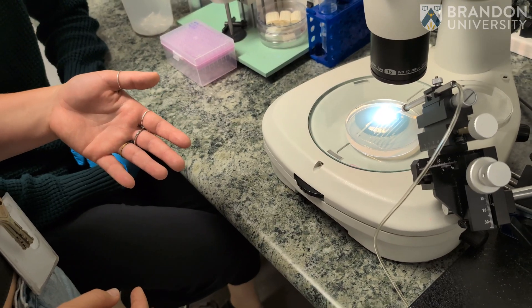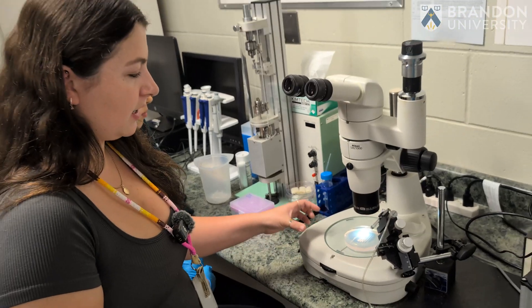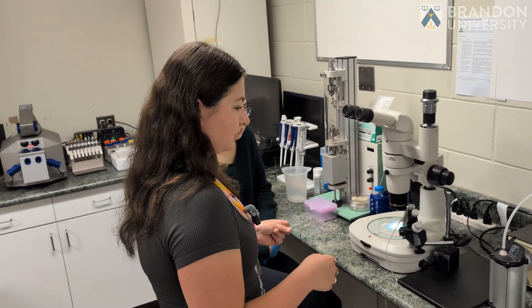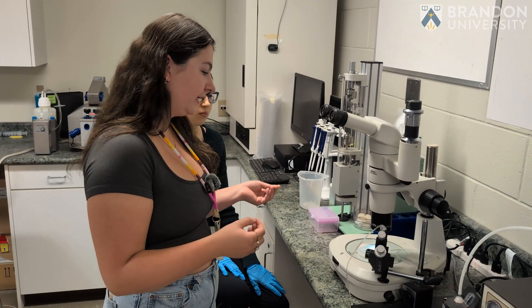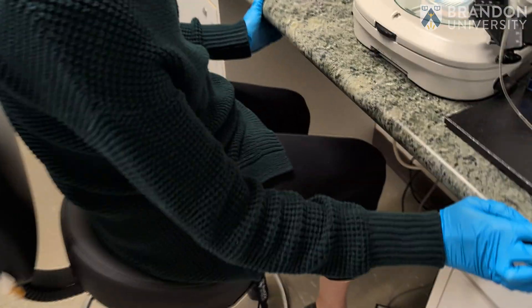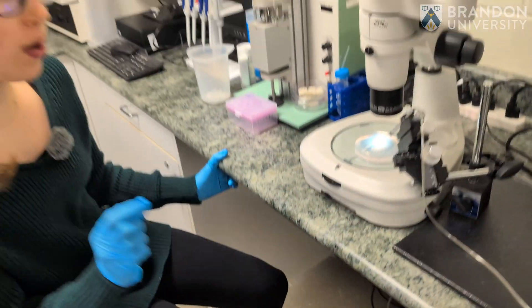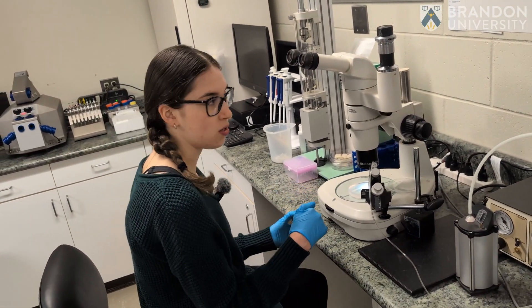The micro manipulator is where we actually set up our needle with the morpholino. We load the needle with our chosen morpholino and then mount a certain amount of zebrafish embryos to inject with our solution of choice. The tip of the needle is very tiny and so are the zebrafish embryos. There's a pedal on the ground which my foot will step on, and that will allow a small amount of morpholino inside the needle to actually get into the embryo.